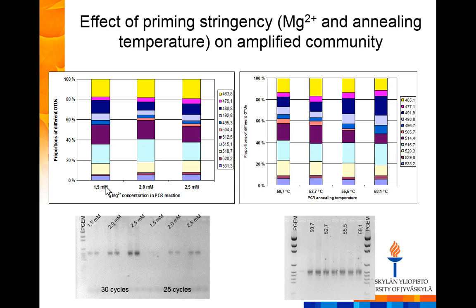Does anyone have an idea why that could be? Primers priming, it's not an exact match, but it's priming something that's almost a match.